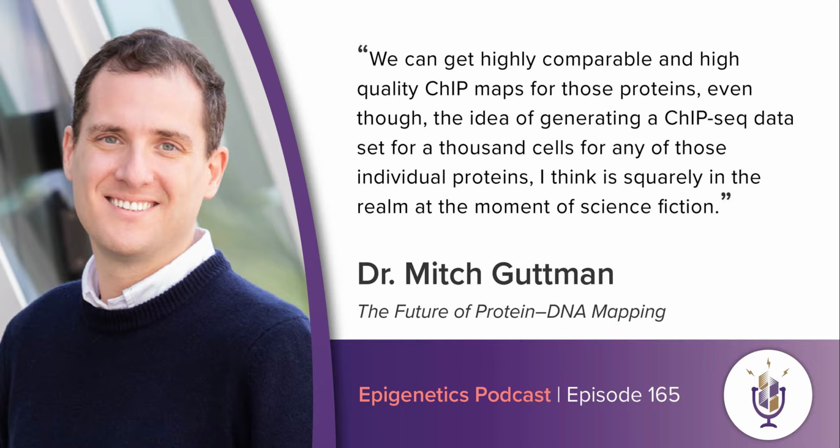But of course, we have millions of beads and millions of chromatin molecules in this reaction. So 1 out of 96, or 1 out of 100 in my updated numbers, is not that great. We still can't resolve pairing. But what we can do is iterate this. We can pull things back together, split them again, and add new tags.